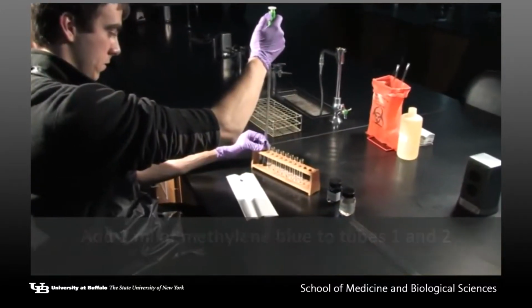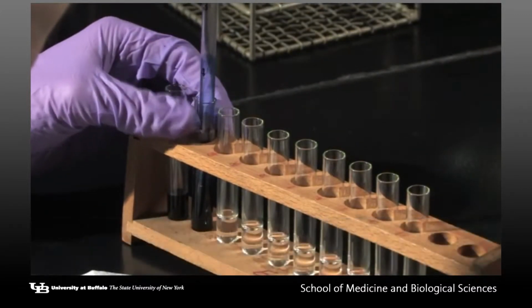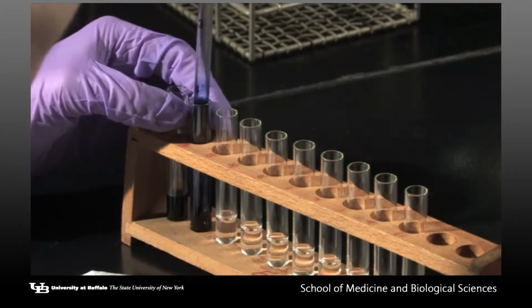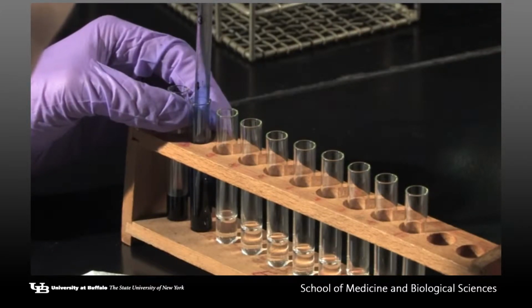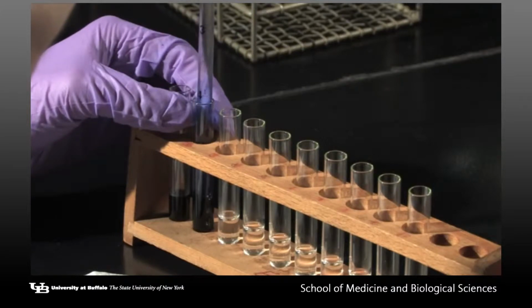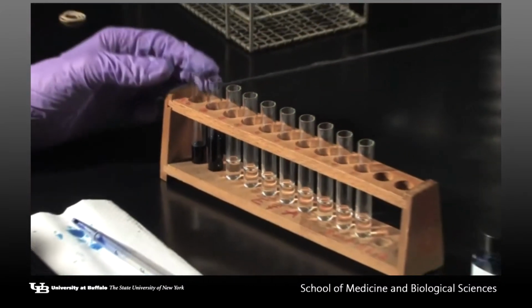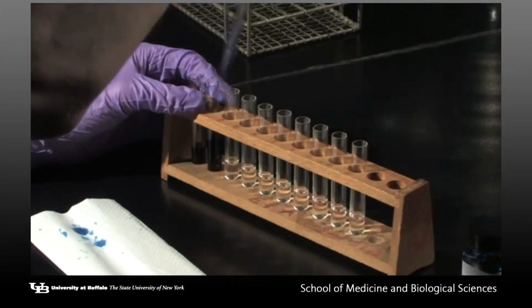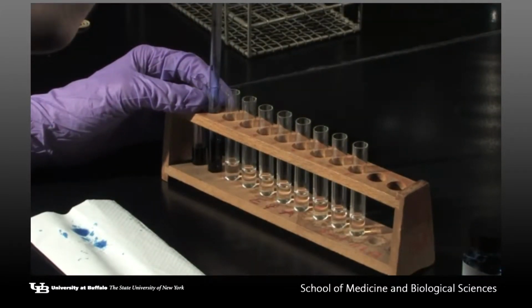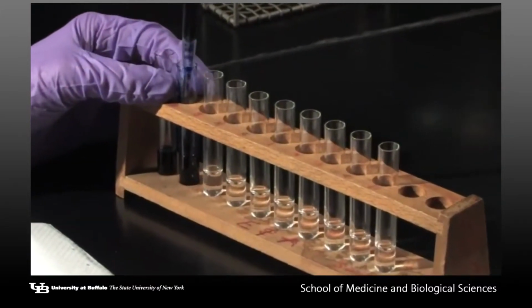With the same pipette, mix the contents of tube 2 by drawing the contents up into the pipette. The process of drawing up and dispensing out is considered to be mixing. To mix thoroughly, this should be repeated a few times. Note that tube 1 contains undiluted methylene blue, whereas tube 2 has half the amount of methylene blue, since tube 2 also contains 1 ml of saline. There is 1 part of undiluted methylene blue and 1 part of saline, which equals 2 parts or 2 volumes.